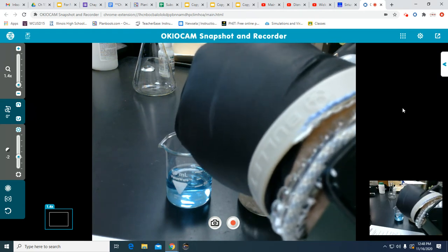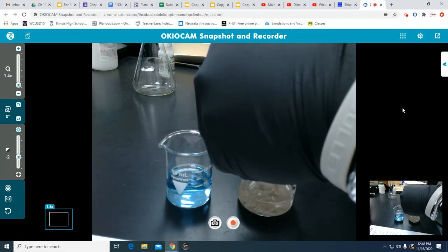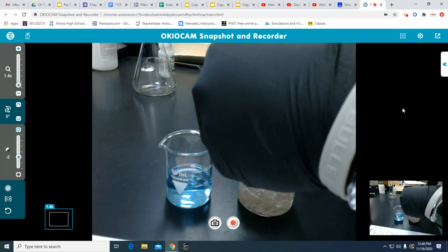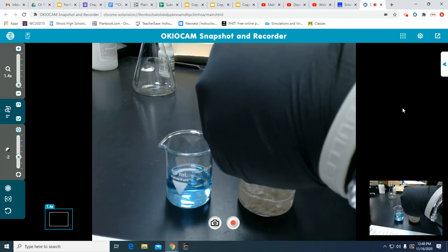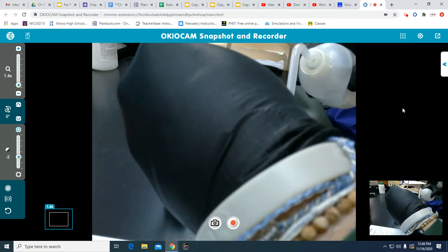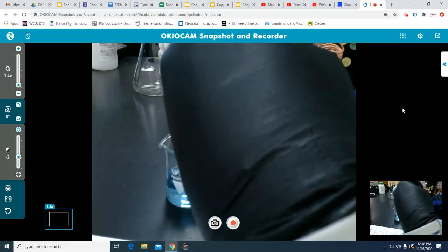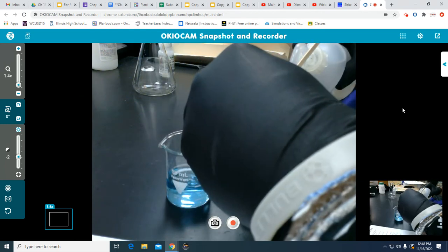And see, since I made my rings pretty closely wound together, it doesn't come off as easily as if you had it wider. Make sure I get everything down in there. It says to use about 40 milliliters, and I used about 40 milliliters. It's like they've done this or something.